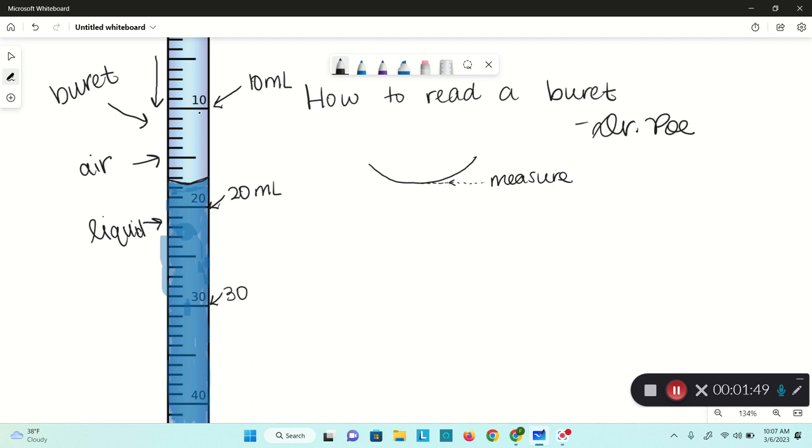The next thing is we've got to figure out what the different lines that aren't labeled are so that we can get a nice accurate measurement. Each burette is going to be just a little bit different, but it's nothing you can't figure out. It's just like reading a ruler.